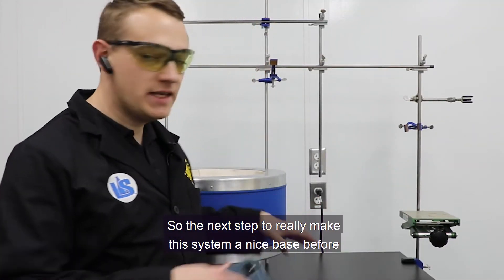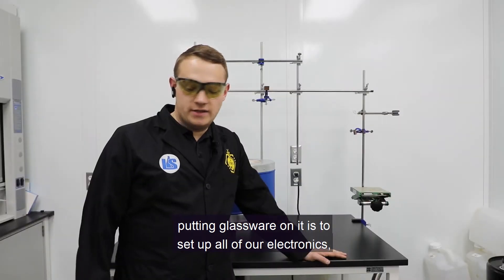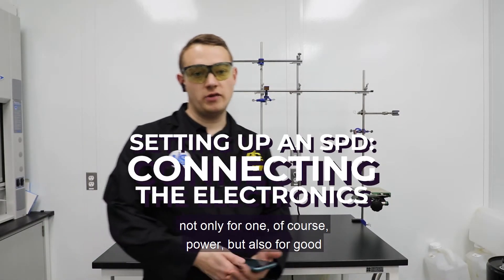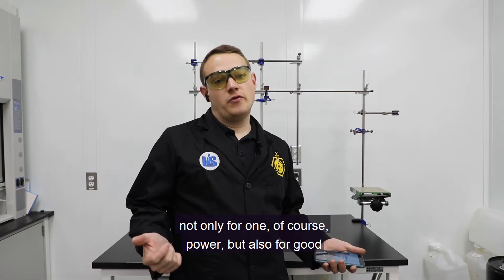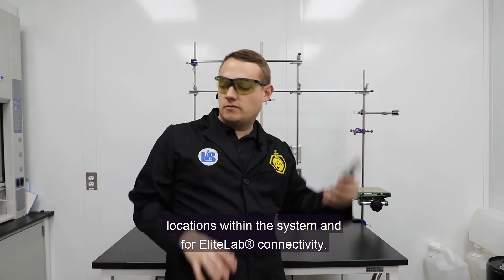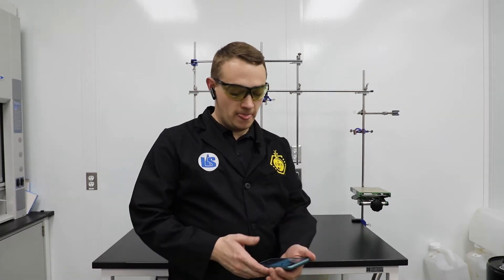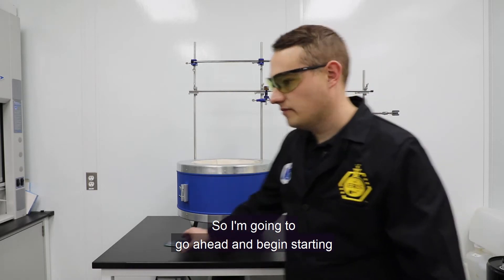So the next step to really make this system a nice base before putting glassware on it is to set up all of our electronics, not only for power, but also for good locations within the system and for Elite Lab connectivity. So I'm going to go ahead and begin, starting with the controllers.